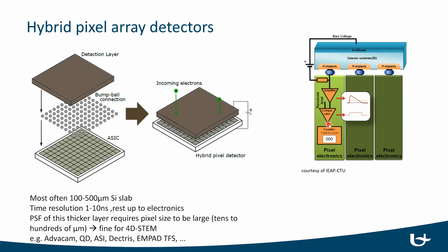And now you're in the digital domain, and you can make use of all the beautiful possibilities in CMOS. You can put counters, you can put complicated digital electronics behind it to do something with these events. Every pixel could have its own counter, and you can detect, okay, on this pixel I received 5,000 hits, and this pixel remained silent. The challenge is still to get this data off to your computer, and the bandwidths are becoming really enormous at the moment.